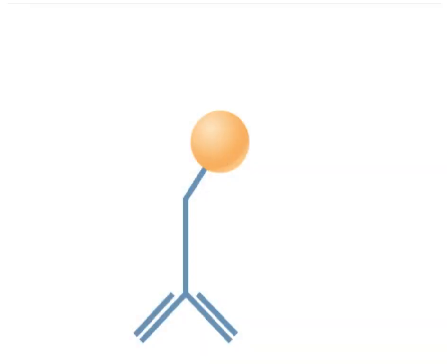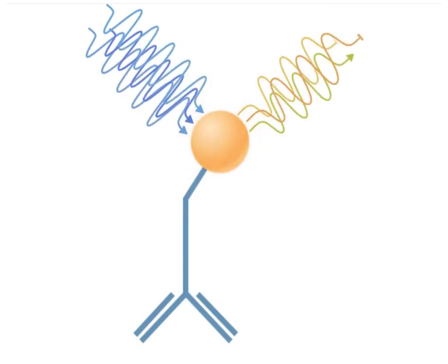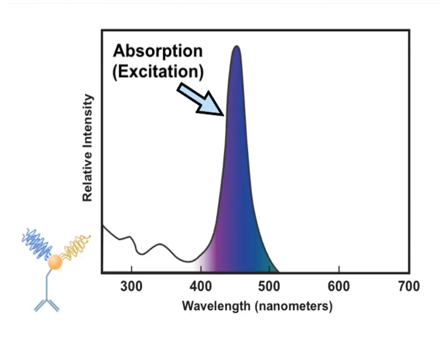When it comes to performing fluorescence microscopy, the fluorophore can be just as important as the microscope itself, and the type of fluorophore being imaged dictates the excitation wavelength used and the emission wavelength that's detected. The excitation wavelengths contain a small range of energies that can be absorbed by the fluorophore and cause it to transition to an excited state.